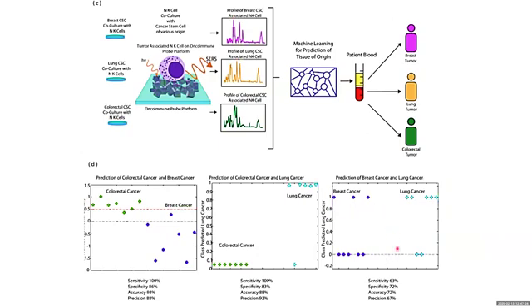This specificity is reduced here between breast and lung cancer, and I'm trying to figure out why we see a similar kind of response from NK cells for breast and lung cancer. So that is ongoing research right now.